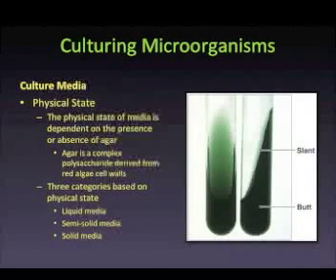Culture media may also be classified based on its physical state. The physical state of the media is determined based on the presence or absence of agar. Agar is a solidifying agent derived from the cell walls of certain species of algae. Liquid media are also referred to as broths, milks, or infusions. Broths do not have agar present. Liquid media can be prepared using tubes, flasks, or bottles. Growth in a liquid media can occur throughout the medium and may appear as cloudiness.